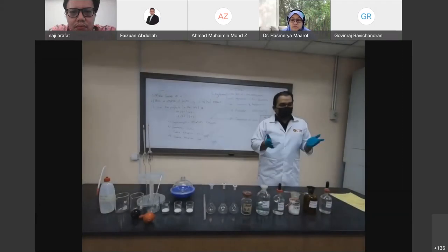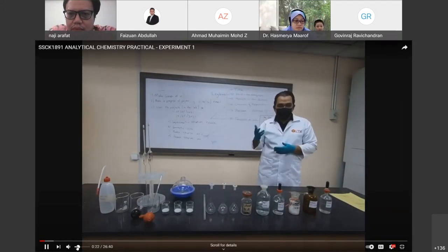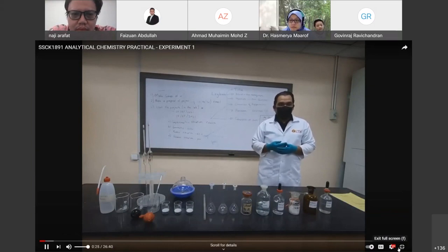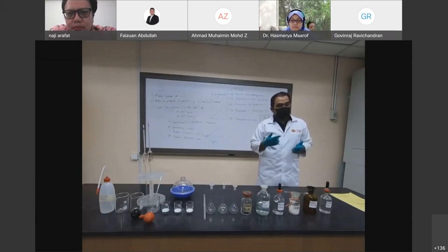Assalamualaikum warahmatullahi taala wabarakatuh and very good morning. My name is Dr. Faizon bin Abdullah. I'm currently a senior lecturer at the Faculty of Science, University Technology Malaysia. Today, I would like to demonstrate to you how gravimetric determination of nickel can be attempted.